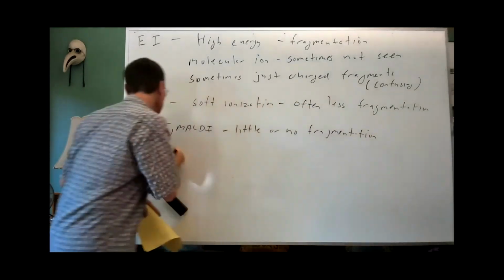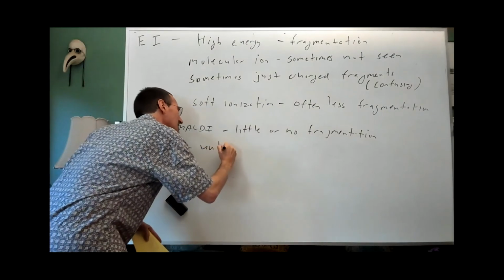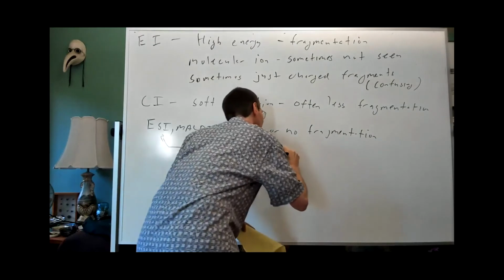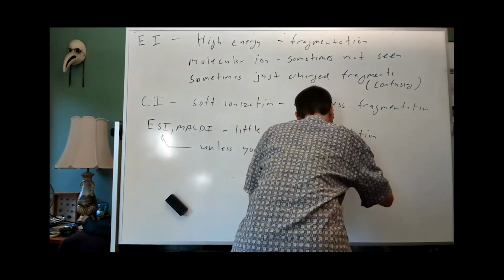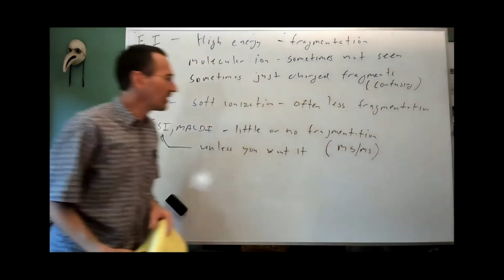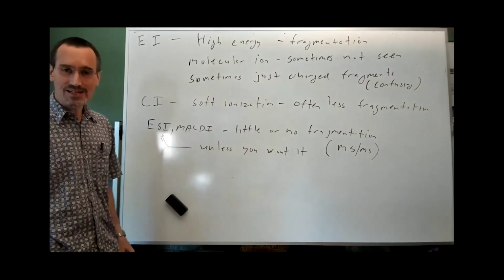And I guess I'd say, particularly with ESI, unless you want it, for techniques like tandem mass spec, where you're deliberately selecting your ions and deliberately fragmenting them.